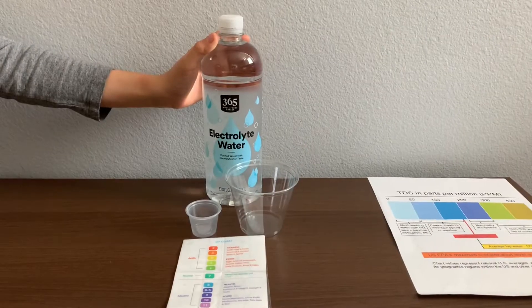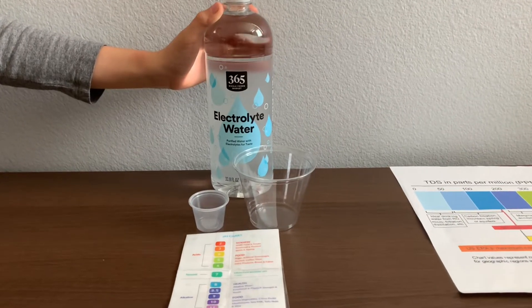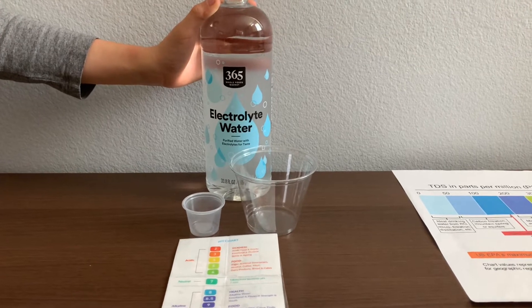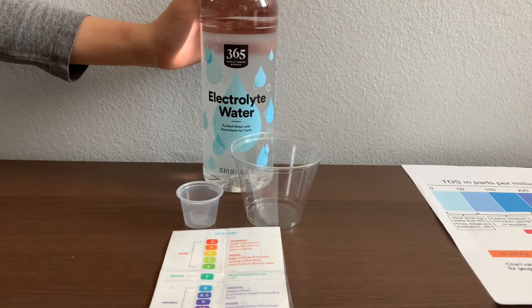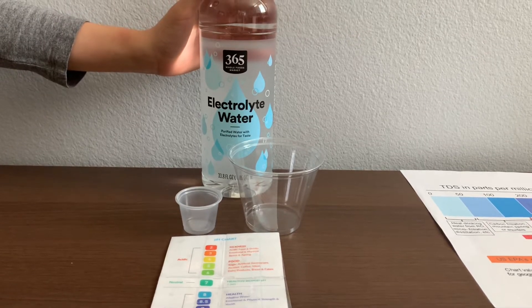This is 365 Whole Foods Market Electrolyte Purified Water, sourced from a local municipal source. It's purified by reverse osmosis. Each bottle costs $1.19.